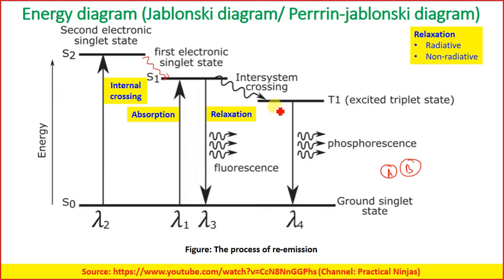However, in phosphorescence, it is absorbing, then after some time it is releasing. So it is taking some time. This intersystem crossing, first of all, would take some time, and then once it has achieved the T1 phase, then it will happen. So basically, this intersystem crossing may be one of the criteria, and it will depend on the molecular architecture of the molecules.